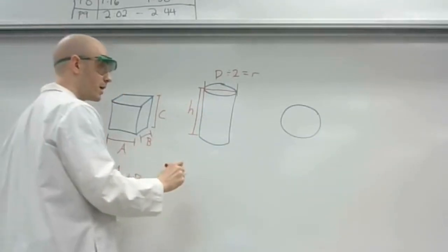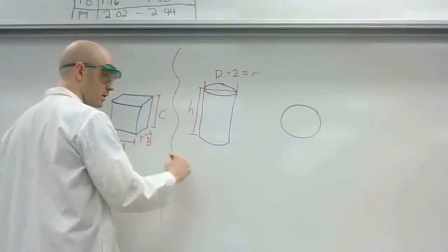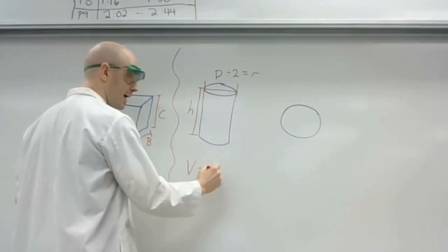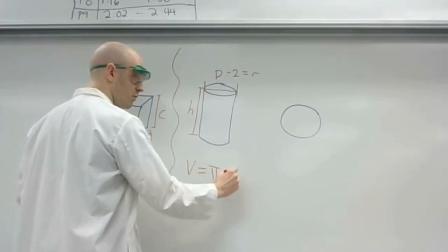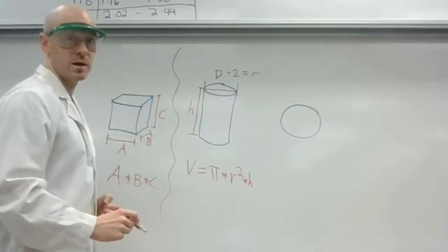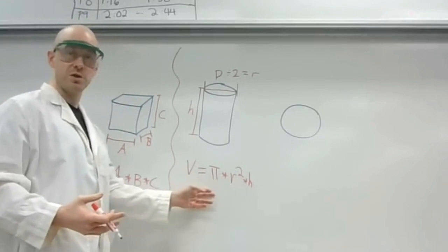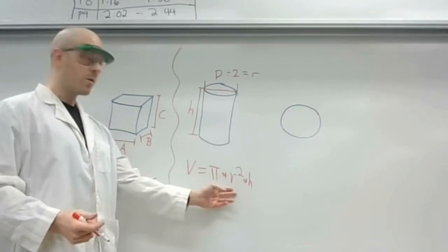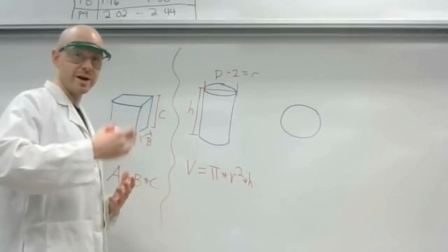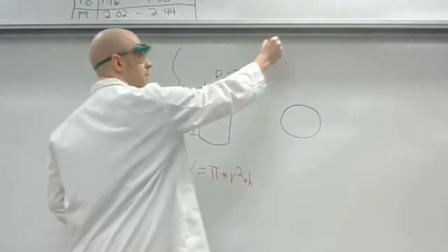And our formula for calculating this is the volume, V, equals pi times that radius squared times that height measurement. Now, pi, if it's not in your calculator, just use 3.14. When we end up squaring that radius, know that you could just multiply by the radius twice. That would give you the same result. And height is whatever you measure this in.